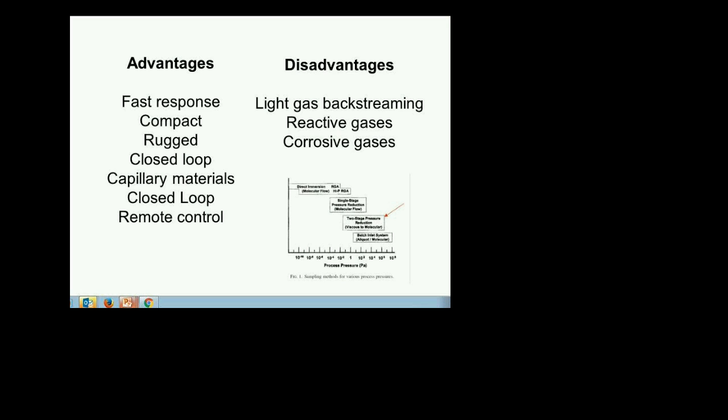The only thing you have to worry about in this case is, first, while the RGA is sitting, do you isolate it when you heat it? You're doing all the heating and all that? Yes, I do it in hydrogen, so it's isolated. I have a valve. Beautiful, so that should clean it. The only thing you've got to worry about is that while it's not being used, you keep it under vacuum and bake it out, so that whatever it was exposed to last time is gone, and that you get a nice background spectrum to figure out where you are.